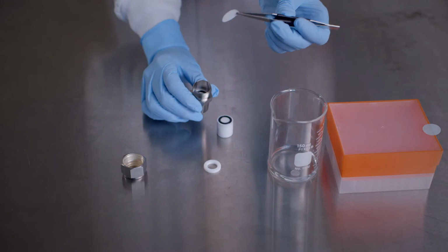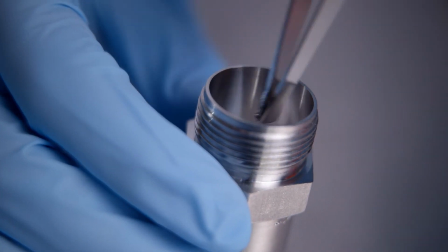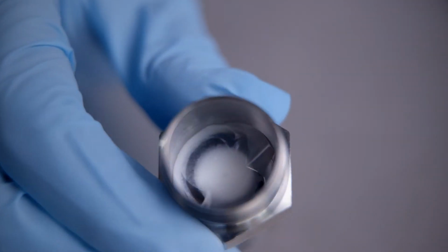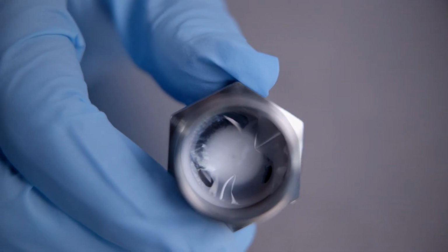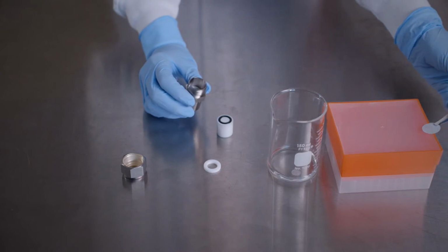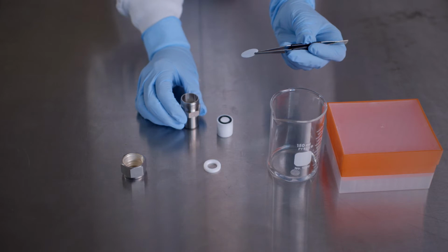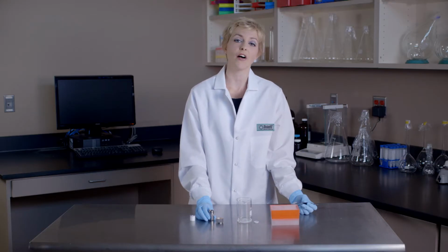Next, we will install our polycarbonate membrane into the extruder outer casing over the top of the filter support and the O-ring. As a note, the polycarbonate membranes are the thin, shiny discs, not to be confused with the blue paper discs, which are separators only used to separate individual membranes and should not be installed. Additionally, the polycarbonate membranes and filter supports are intended for a single-use liposome preparation and should not be reused.